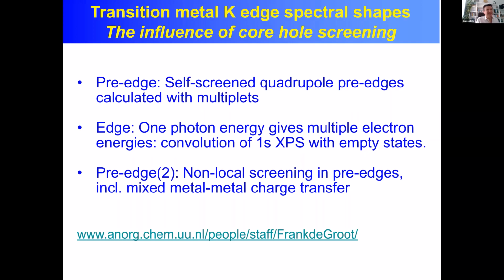The consequence of that is that there's an enormous non-local peak. So maybe that's the correct interpretation: the large pre-edge in copper 3+ systems is the non-local peak again, and the real pre-edge you don't see, or it's very small before the visible pre-edge.